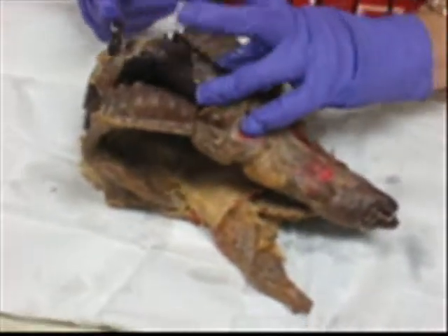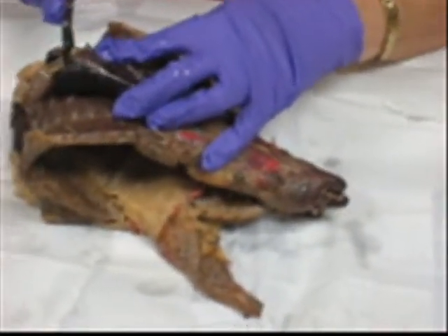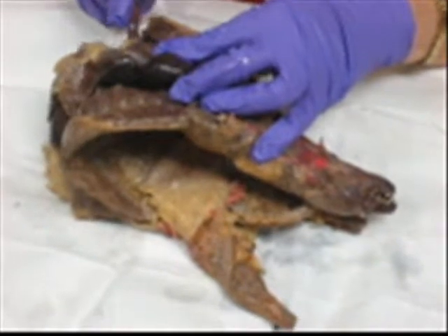We're going to cut it — make sure that our fingers are not here in case the scalpel slips and you lose them. Look halfway between the width of the heart and cut down.